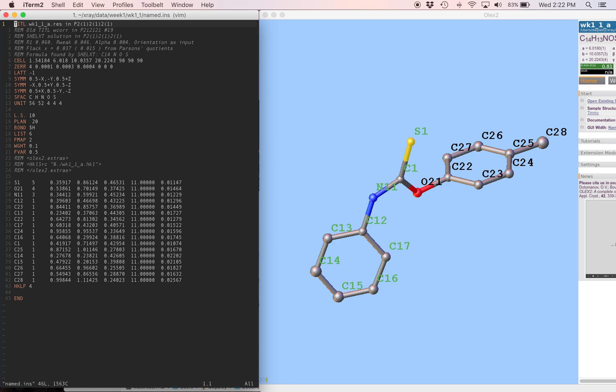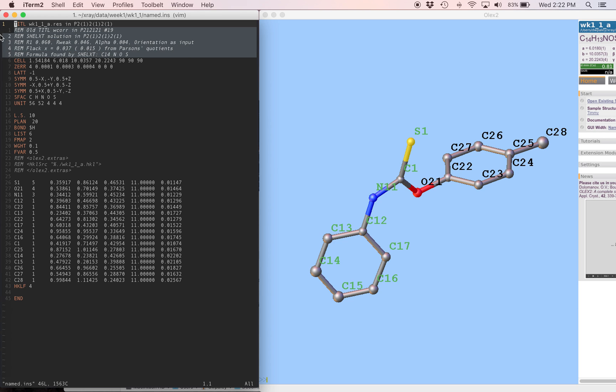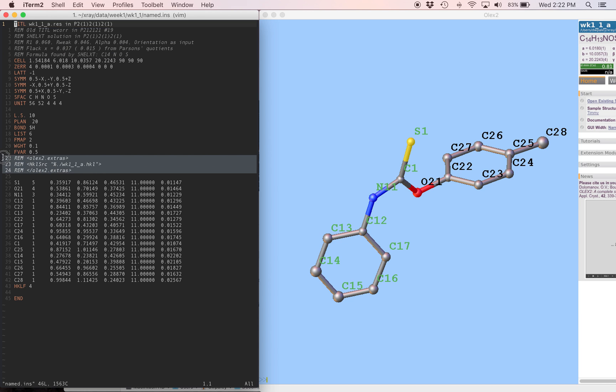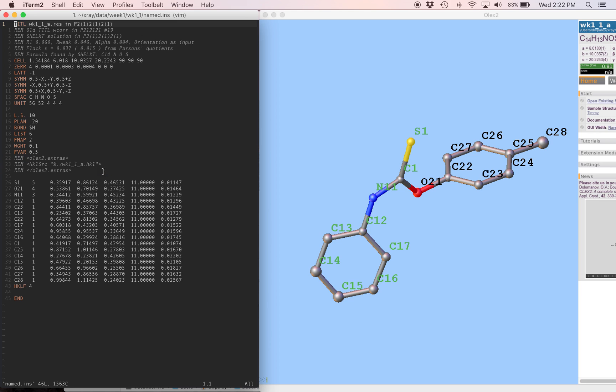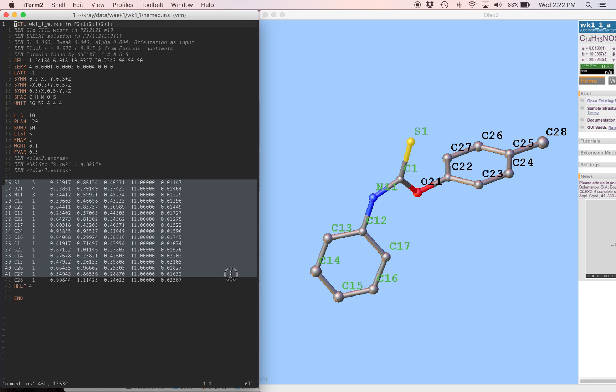Everything is pretty familiar here. We have a lot of the same instructions that we've gotten used to. ShellXT is going to put a few comments in here, but they start with REM, and that means ShellXL is going to ignore them. And it's pretty safe for us to ignore them too. Olex2 puts some information in here as well. This is just so that Olex knows where to find the hkl file for the structure. But we're not using Olex to do our refinement anyway, so we don't need to worry about that. Finally, we have our atoms down here. And you can see they're named appropriately, but they're in random order right now.